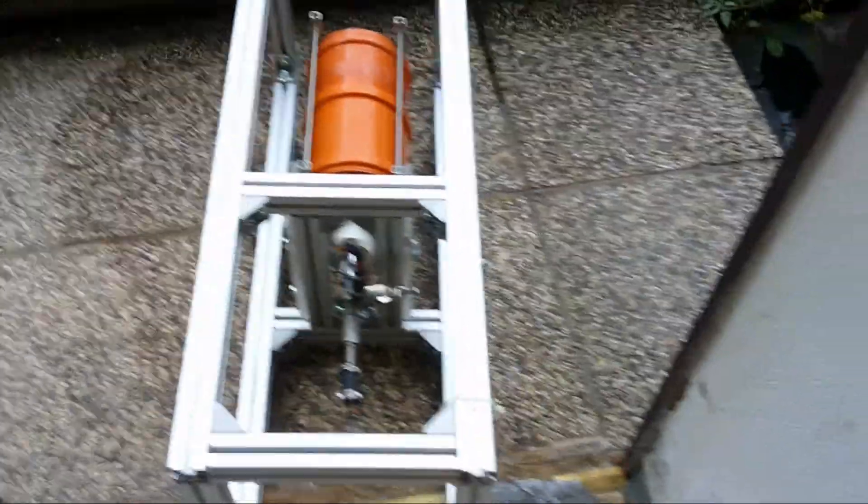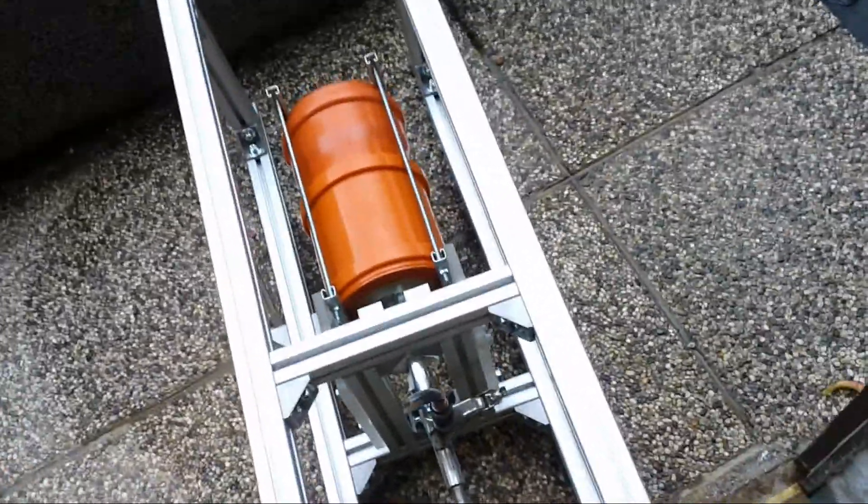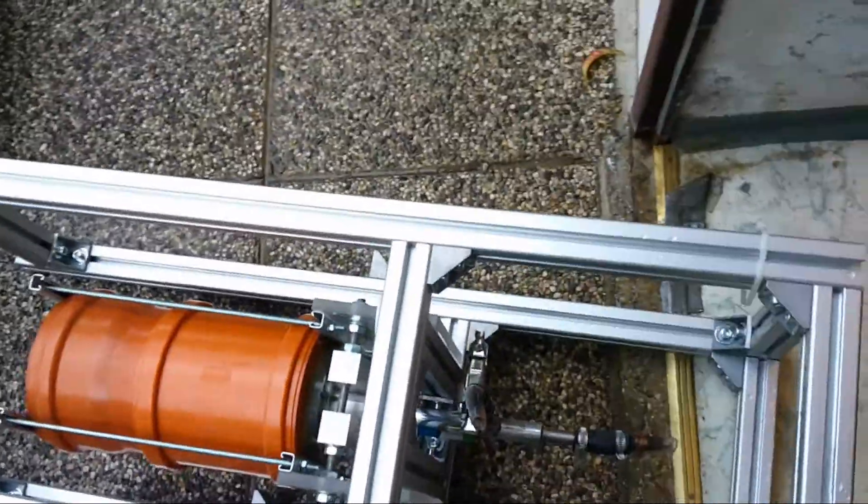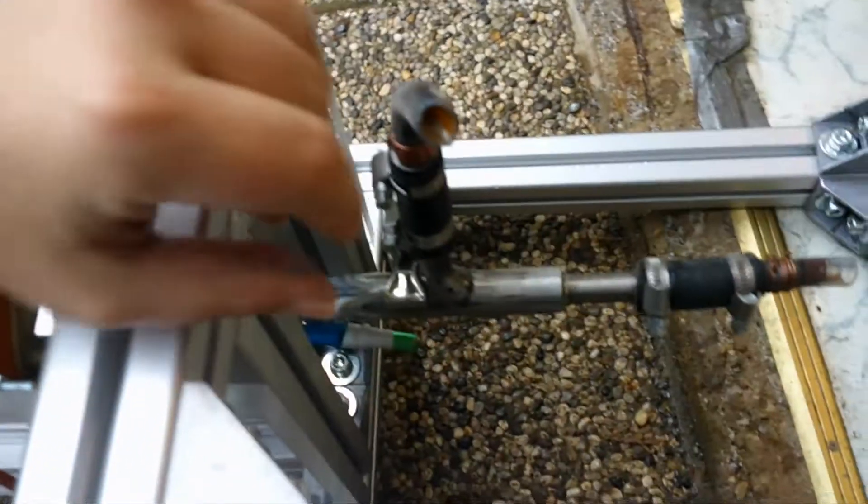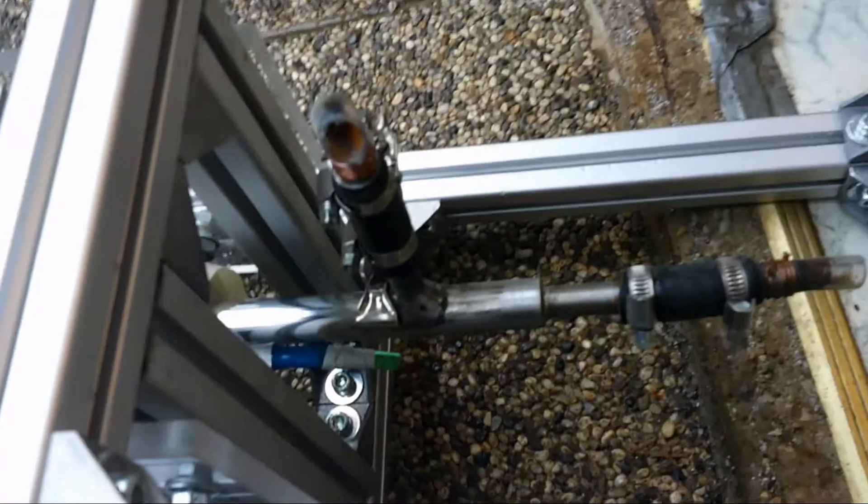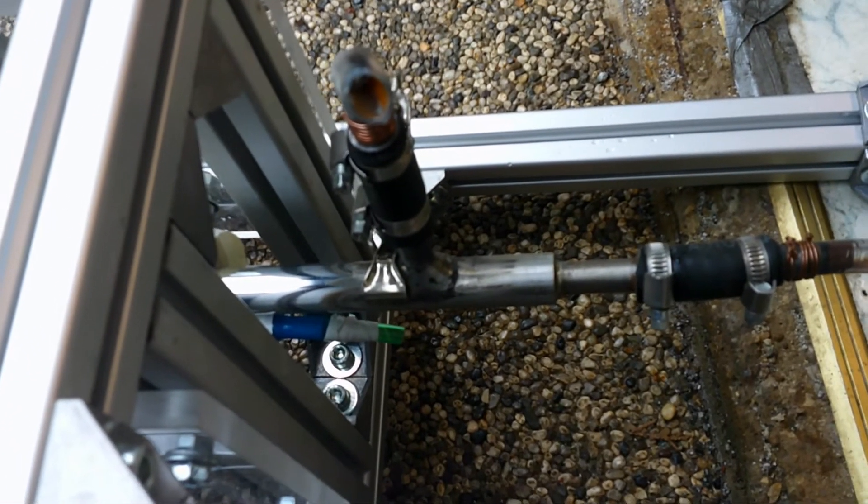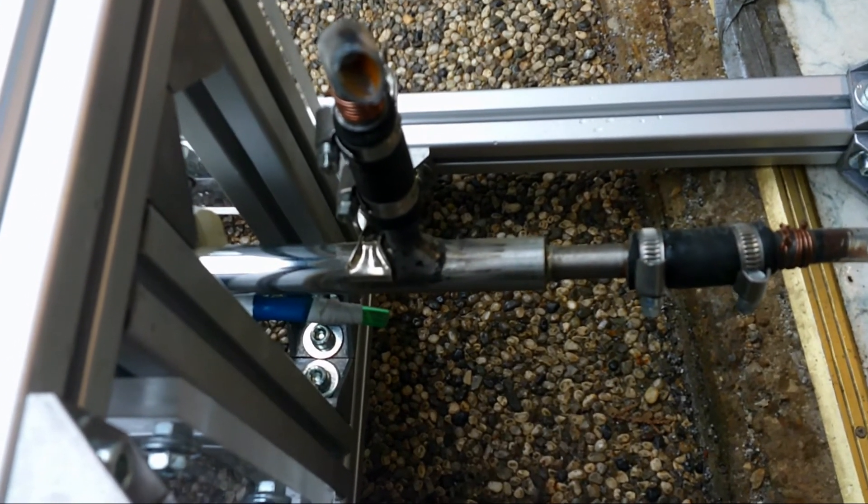However, here it is easy to see the two electrodes. This is one of the electrodes, this stainless steel tube. And this tube here is the other electrode where the high voltage potential is attached to.